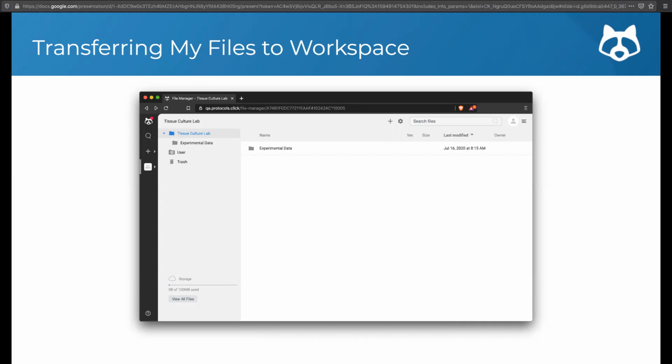Workspaces primarily optimizes your files and folders within the platform and where your protocols are stored. But externally, especially if you've published or added a published protocol or publication to a workspace, it should still be accessible.